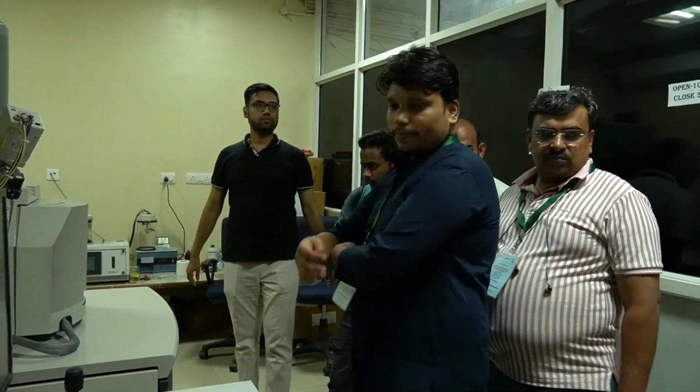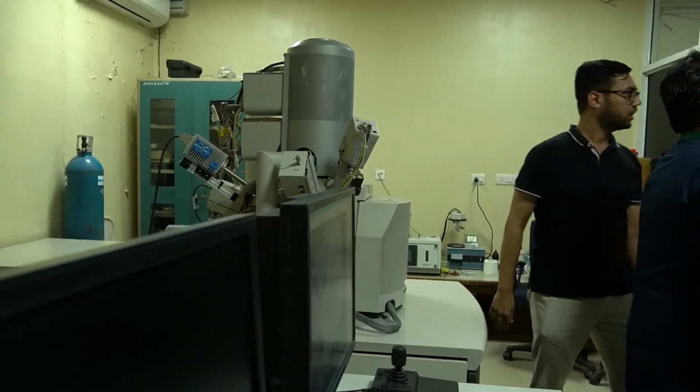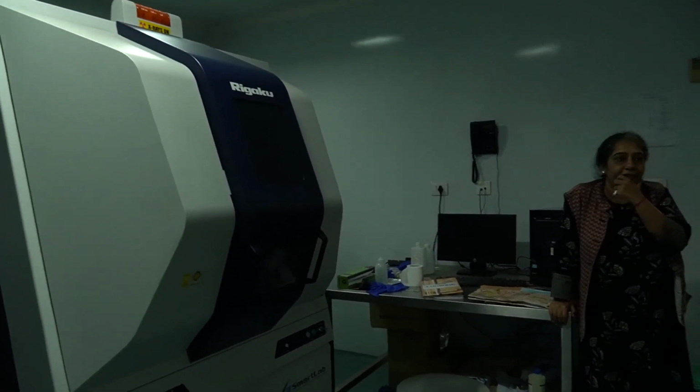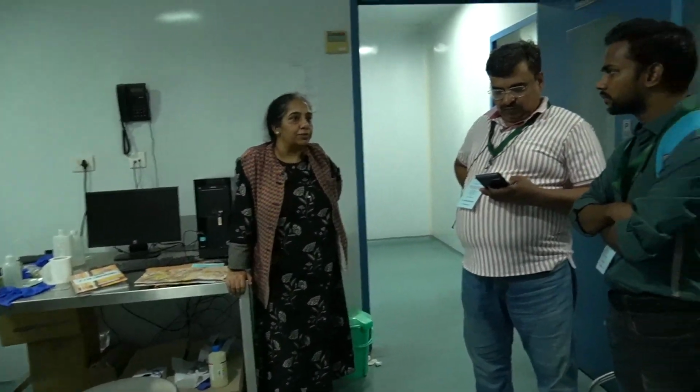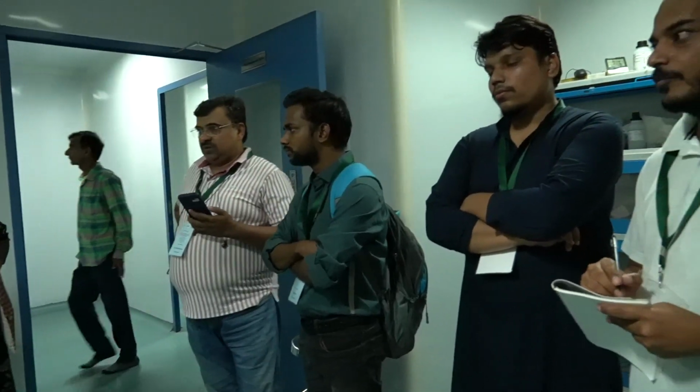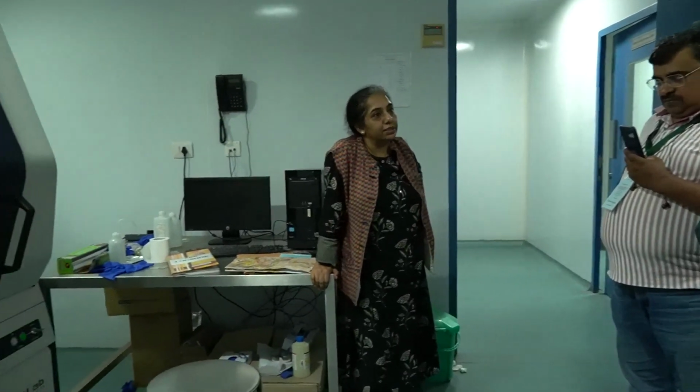Okay, shall we move to the next instrument? Here we are using copper K alpha radiation with a wavelength of 1.5414 angstroms. This is basically used for the determination of crystal structure.